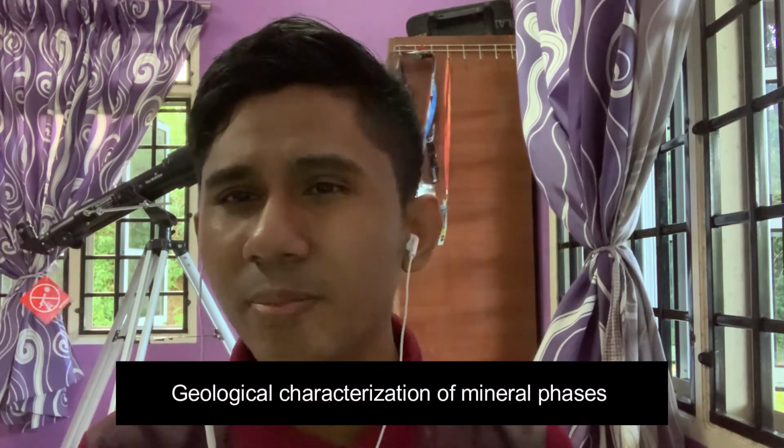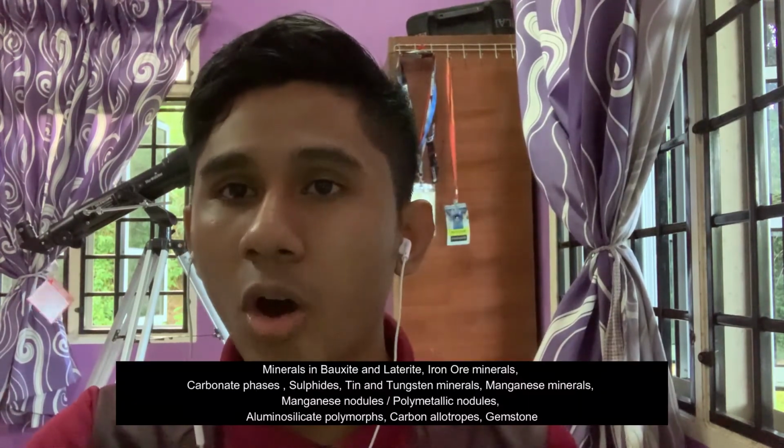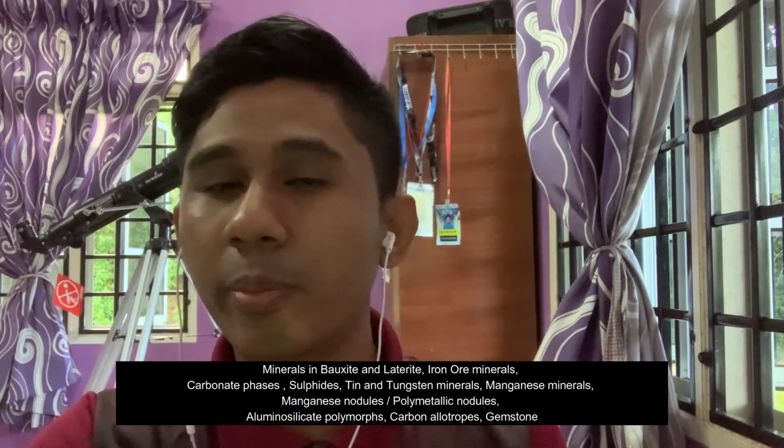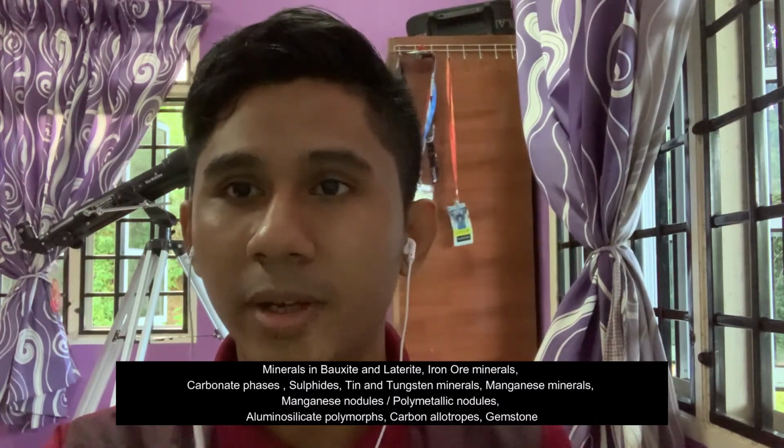Now, we will talk about the application of laser Raman in industry. Usually, laser Raman is used in geological characterization of mineral phases that cannot easily be identified under the microscope. So there are a few minerals that can be successfully identified using the Laser Raman spectrometer or spectroscopy. For example, the minerals in bauxite and laterite, or iron ore minerals, carbonate phases, manganese minerals, and there are many more that can be characterized using the Laser Raman.